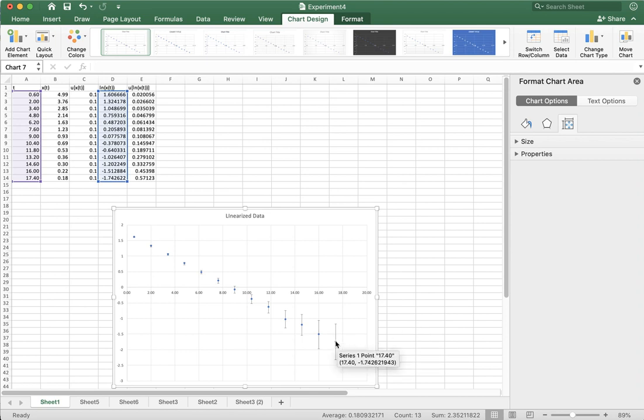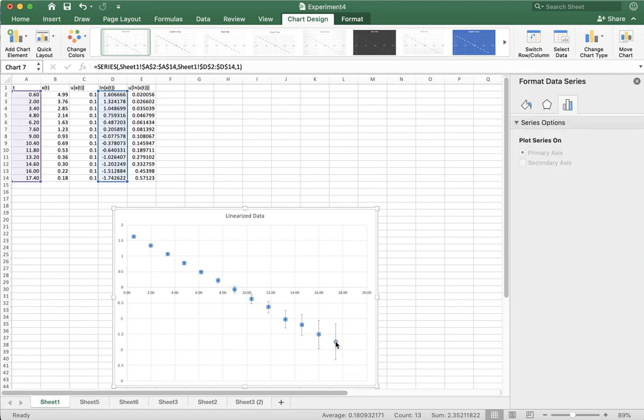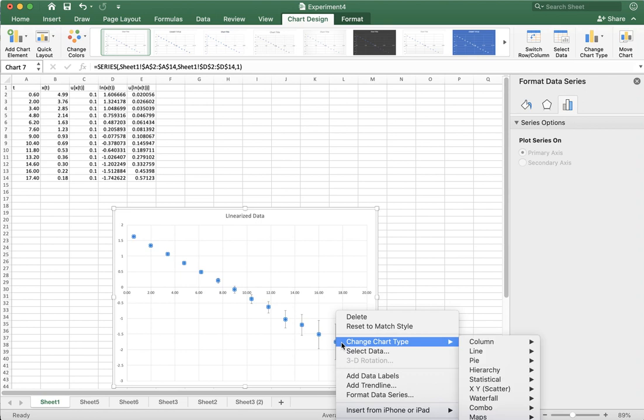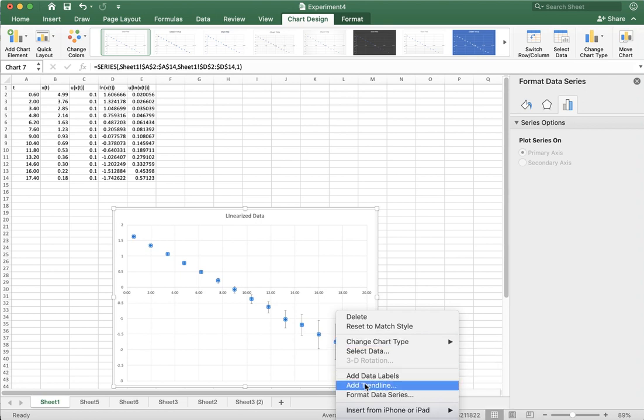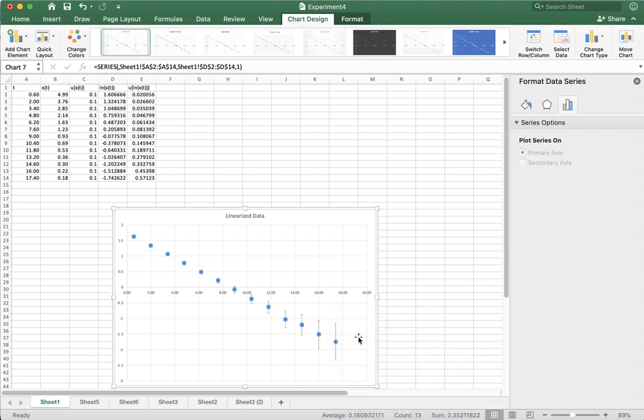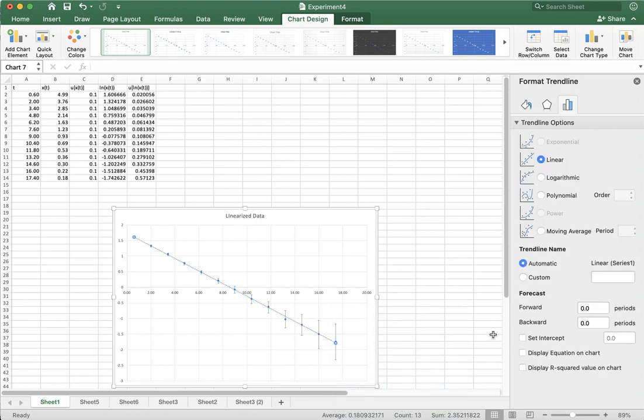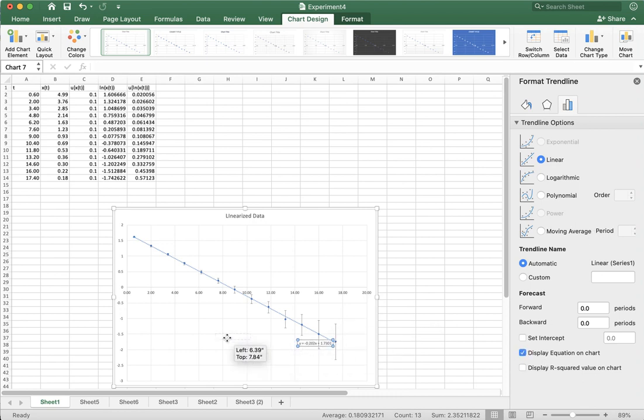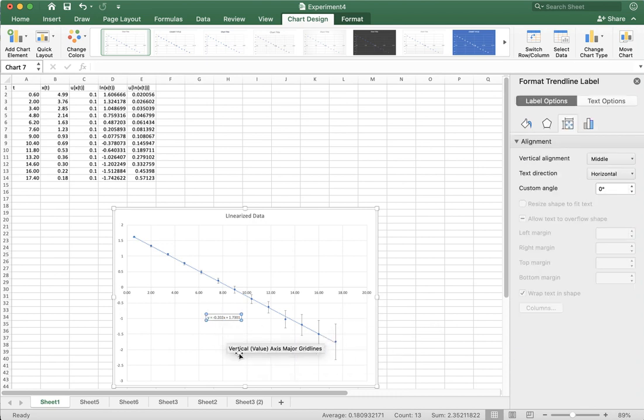And the last thing I can do if I want, well not the last thing I do, but I can add a trend line. It's a straight line, so a linear fit. And I can display the equation, and I can get an actual fit for this trend line. And I'm pretty much done.